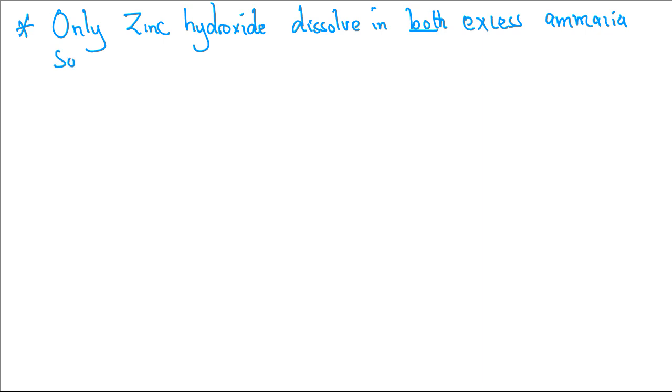Only zinc hydroxide dissolves in both excess ammonia solution and sodium hydroxide solution.